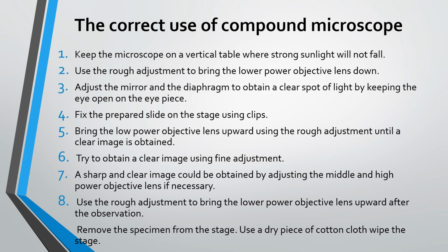And here I have given all the steps that you have to follow in using a compound microscope correctly. So earlier I explained all the steps that you have to follow in using a compound microscope using that video. So those steps are given here. So you can read it, you can pause the video and read these points to get a clear idea to use the compound microscope correctly.